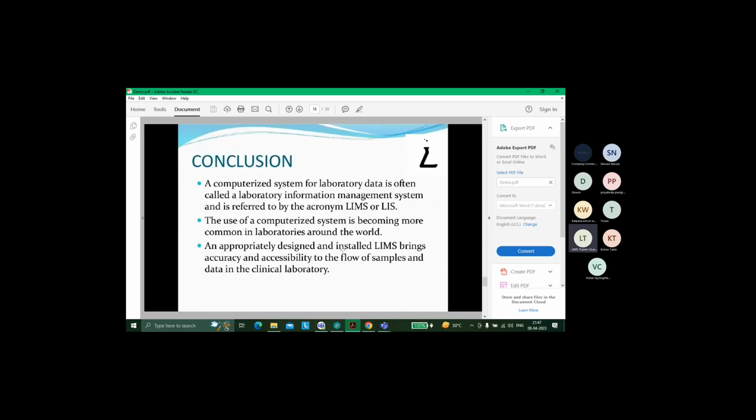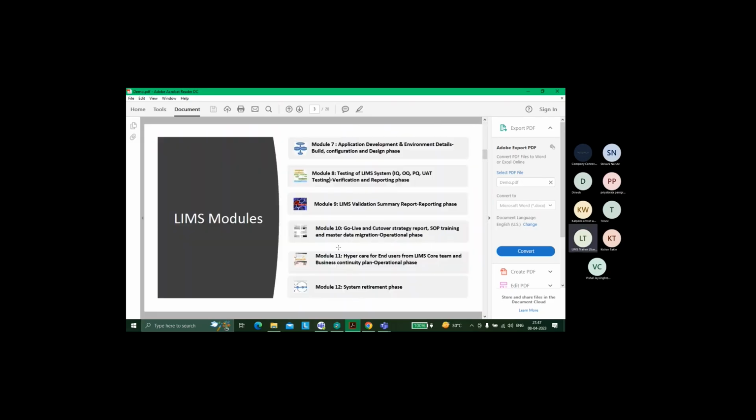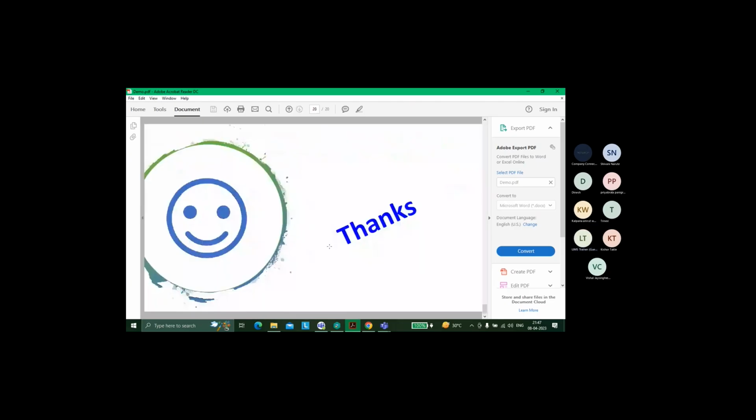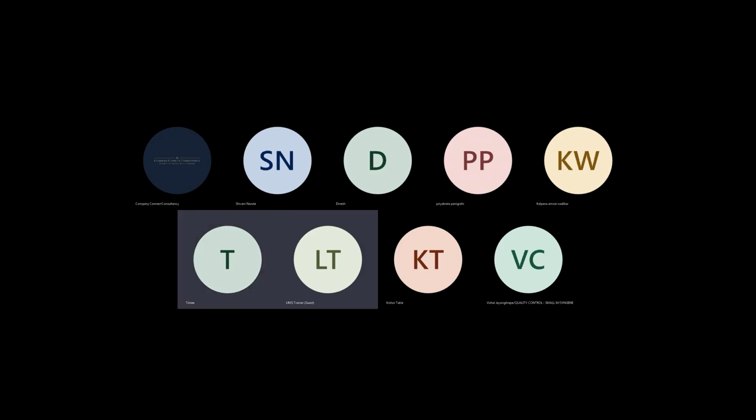So with this, I end the session of LIMS. I mean, this is the demo session. So, going ahead. What are the topics you will cover, sir? Yeah, I'm telling you, going ahead.